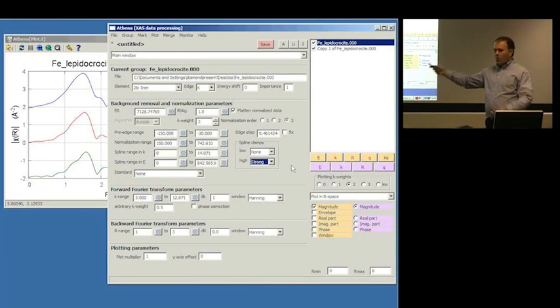Or exactly the opposite. You need to make this small and turn up the spline clamp. In noisy data, there's often a correlation between these two parameters. And if you try clicking Kweight up, you might need to click the spline clamp down. Again, those are the difficult situations where you have to actually think about background removal rather than trust the defaults.